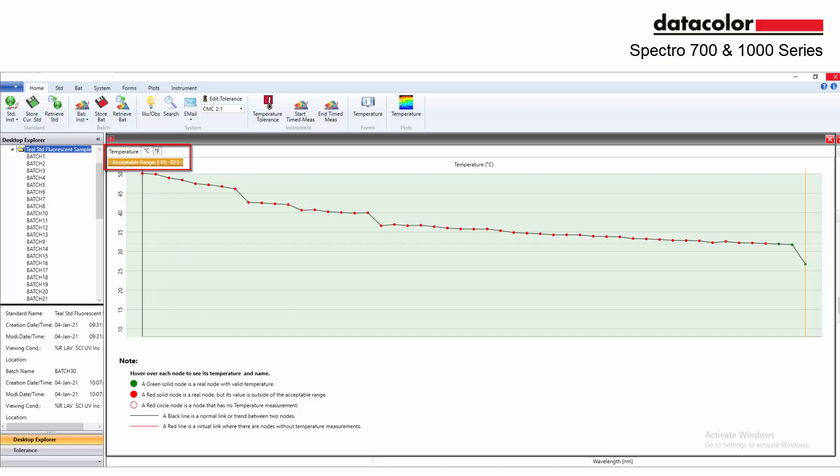The acceptable range defined in the temperature tolerance is displayed at the top of the plot.